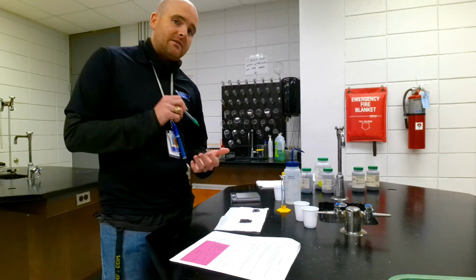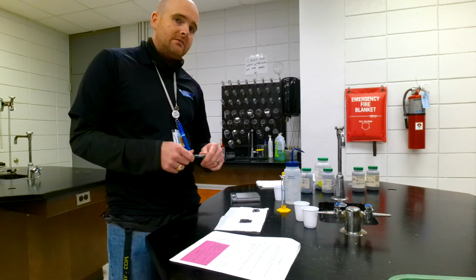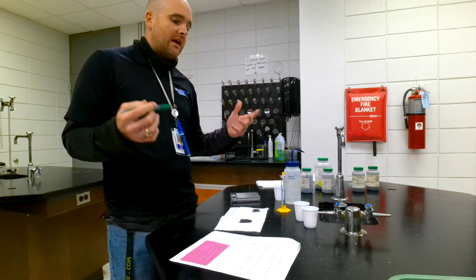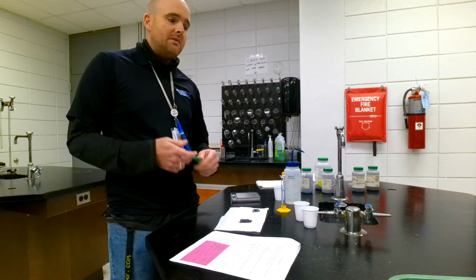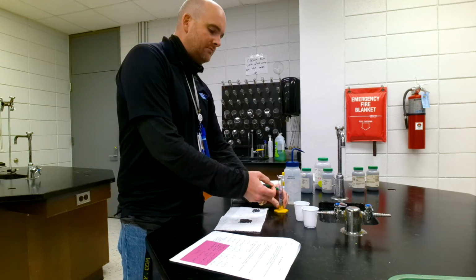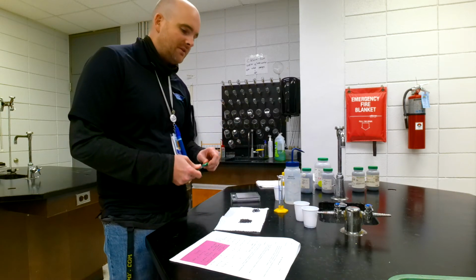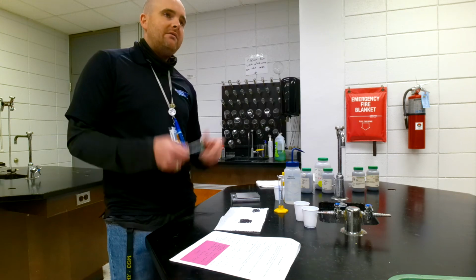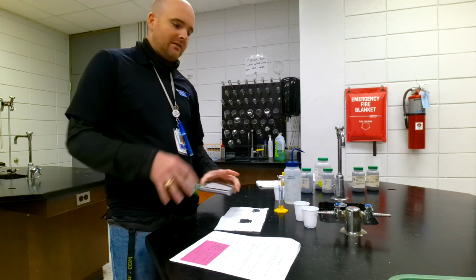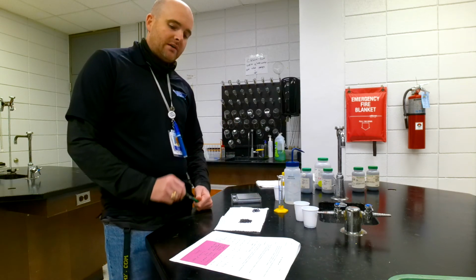The lack of trials could have happened as well. We only ran one trial per metal. So if you ran more trials, and took the average of them, all of the random errors that come with reading the glassware would have averaged out. All the random errors and the error currents on the balance would have averaged out, and that would have worked.